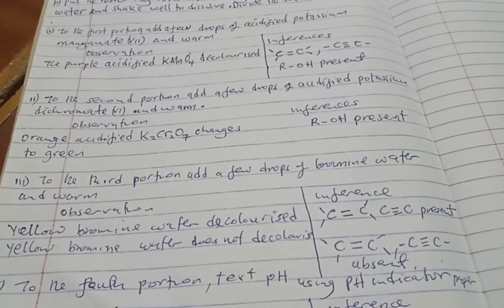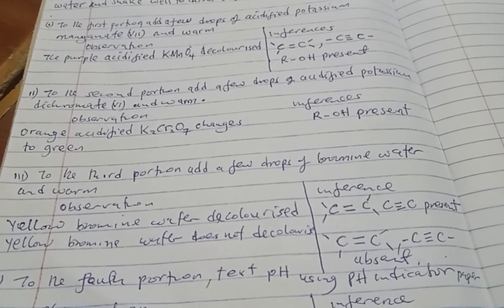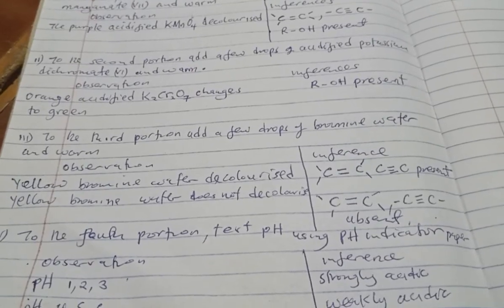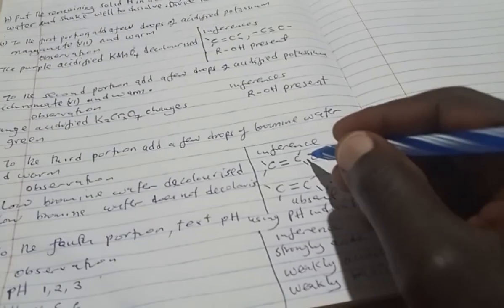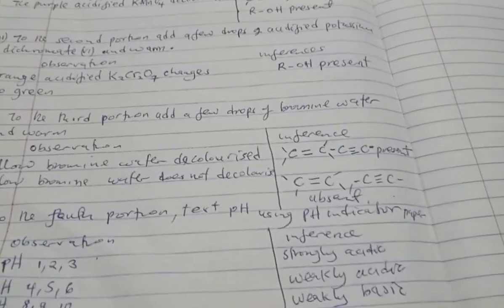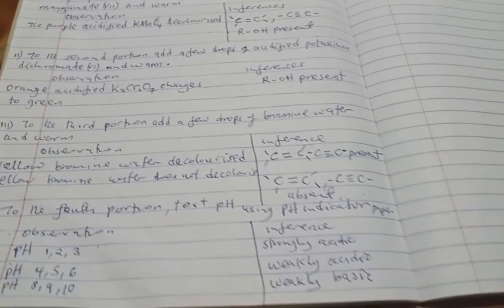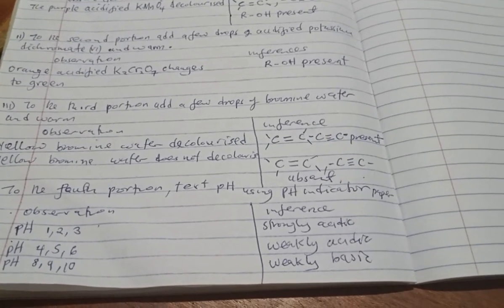So if bromine water, what do we expect? Bromine water is normally yellow. So if the yellow bromine water decolorizes, then the double bond and the triple bond are present, and you write it very well. So you must make sure that carbon has 4 bonds around it.